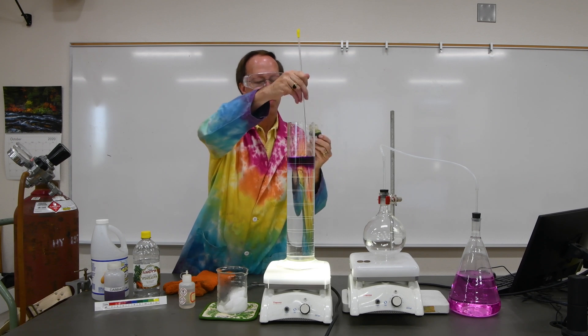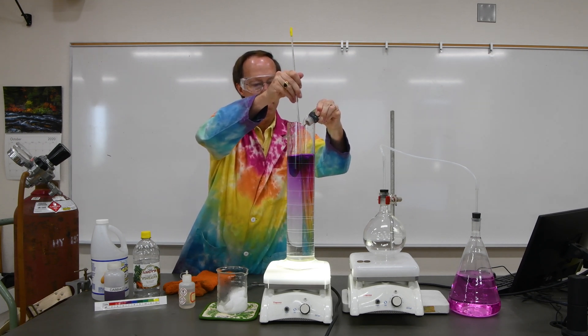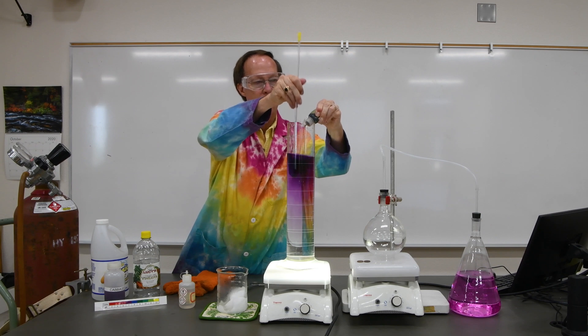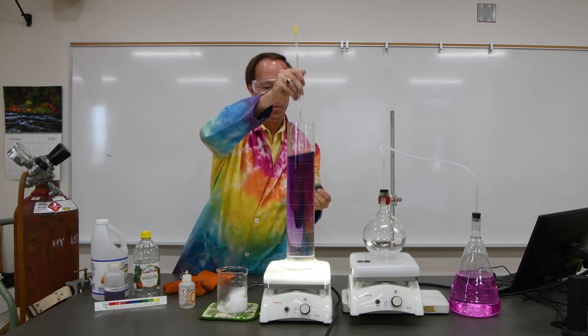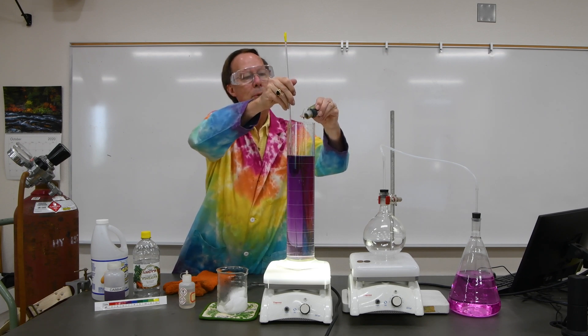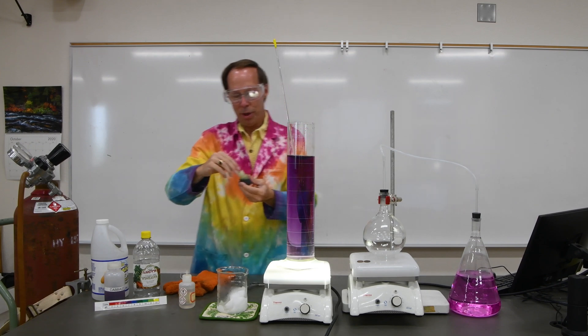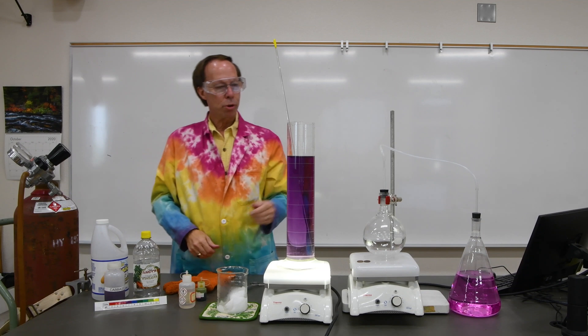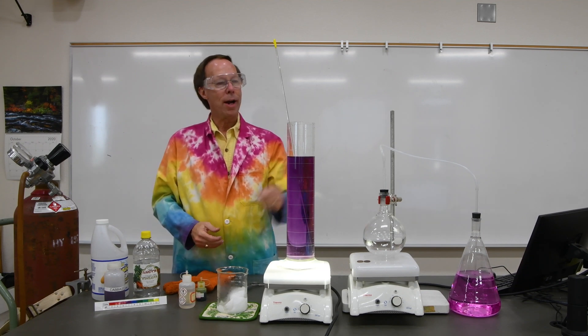We get a lovely nice purple color here. That's a pretty good looking purple color. Now to make the solution acidic we're going to add some dry ice.